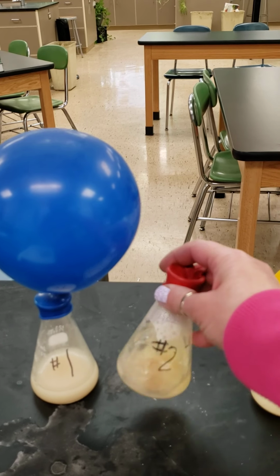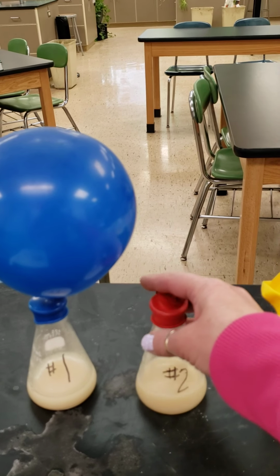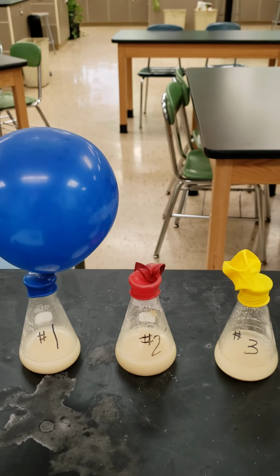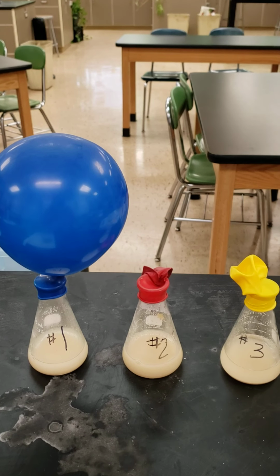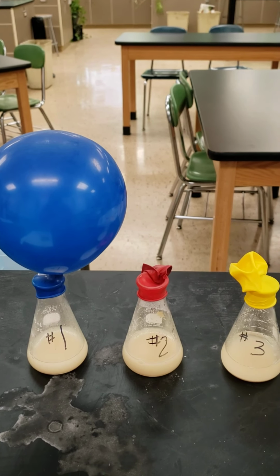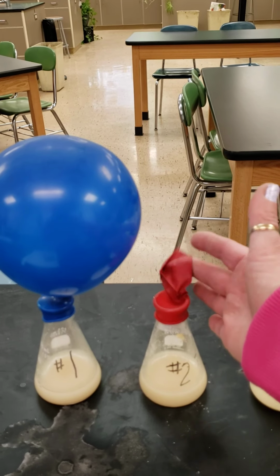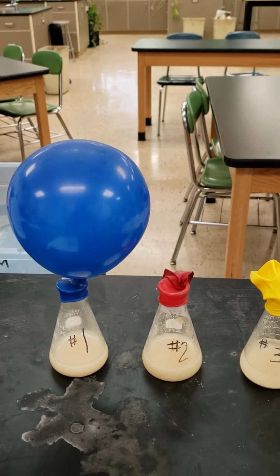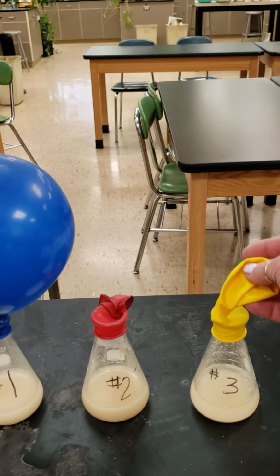Flask number 2, the boiling must have done something to that yeast. What do you think it did to the yeast? Is the yeast still alive? It's got food. It's got everything it needs to do cellular respiration, and it didn't. So is the yeast still alive? Flask number 3, the yeast has no food.